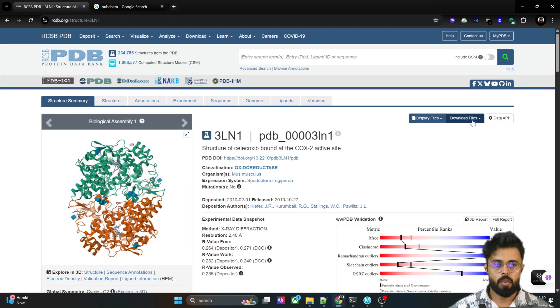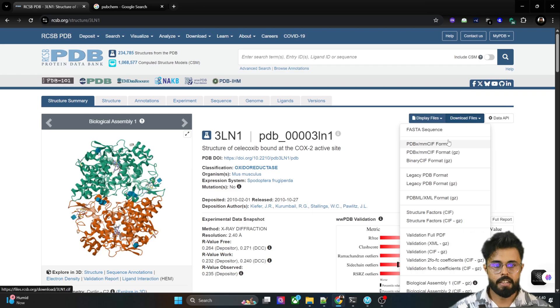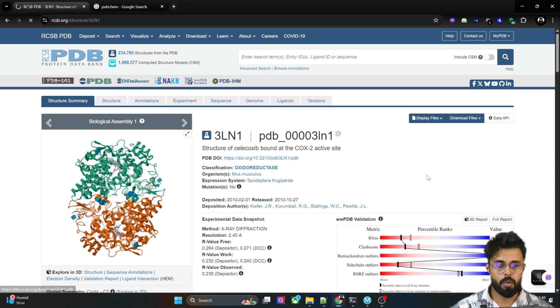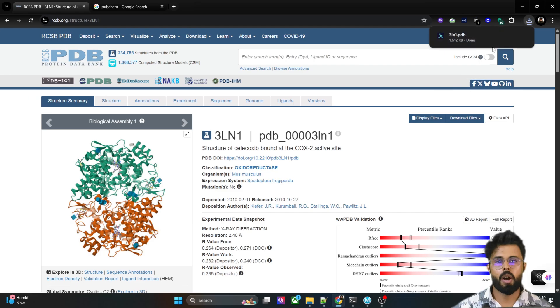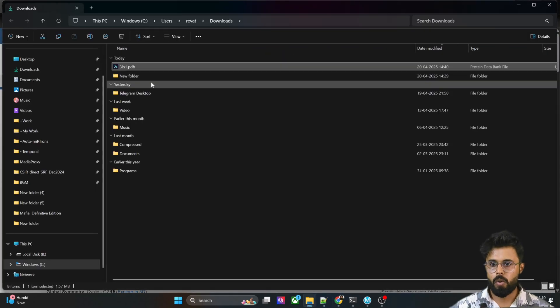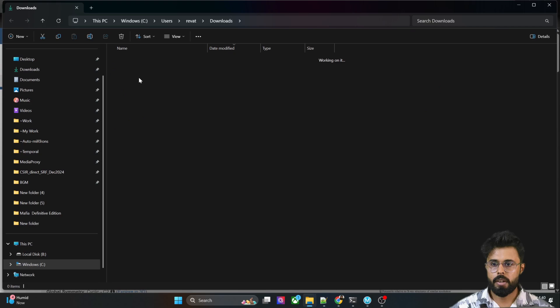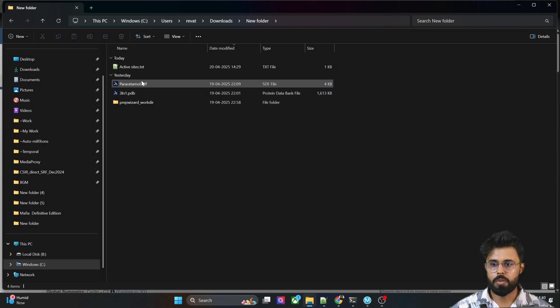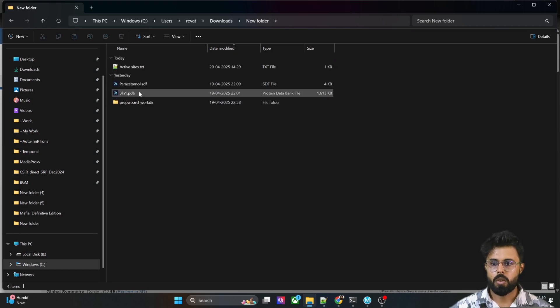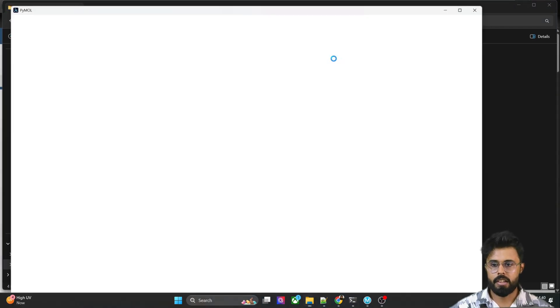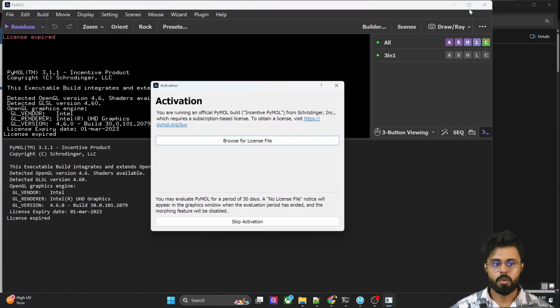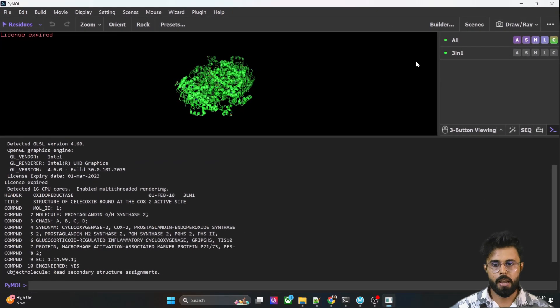We can download from the download file section and go for the legacy PDB format. Clicking that will automatically download the structure. I already downloaded it, which you can see in the folder. Let's open it using the PyMOL visualizer.